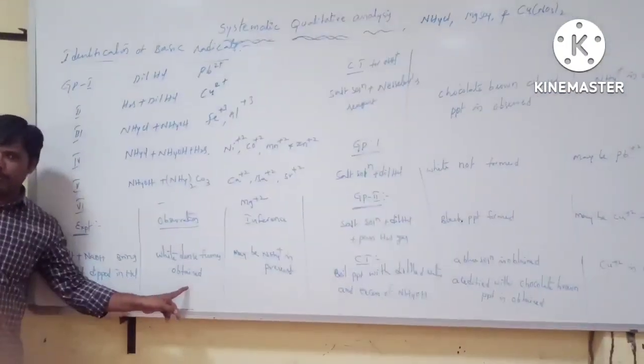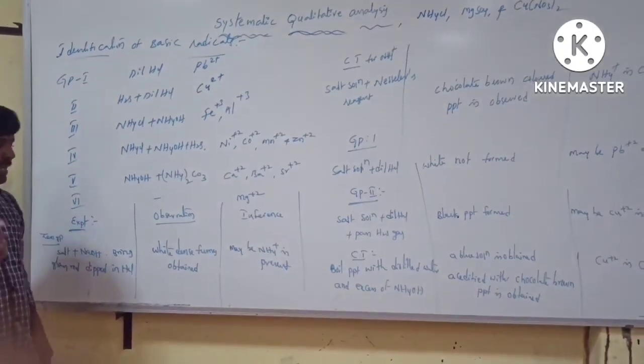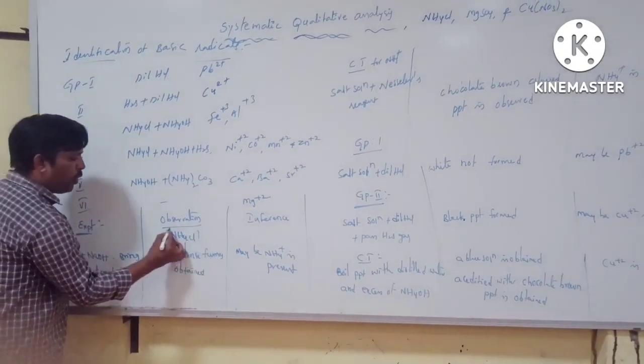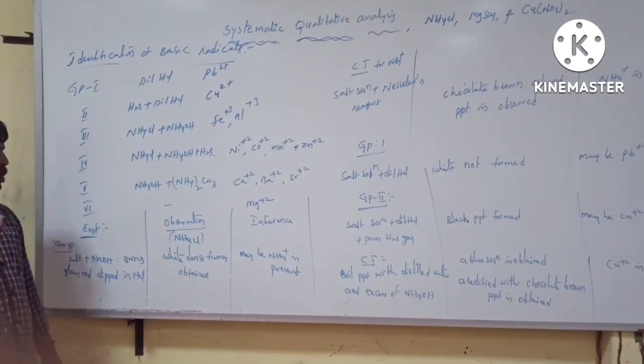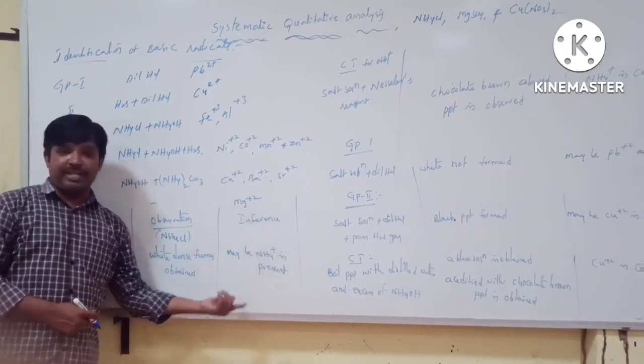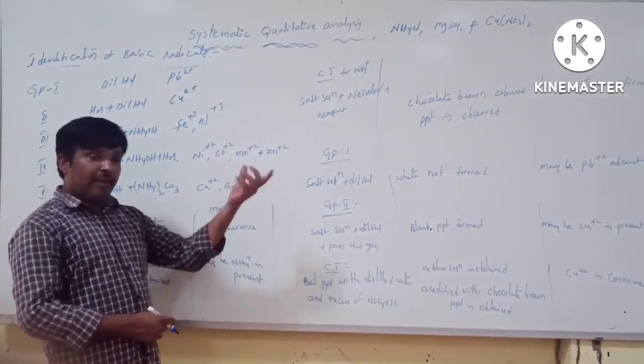White dense fumes are observed, because of NH4Cl, ammonium chloride. That indicates NH4 plus is present.